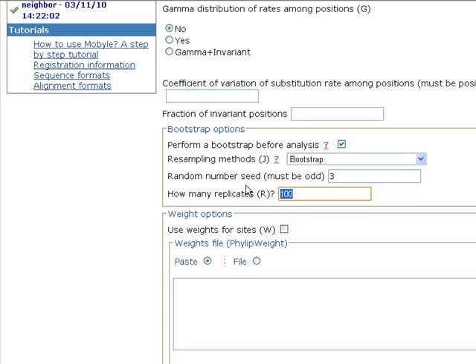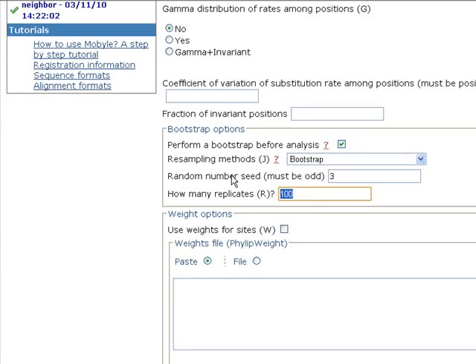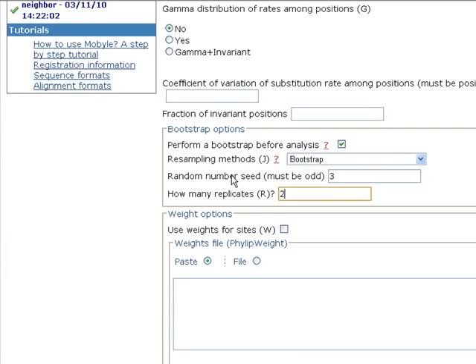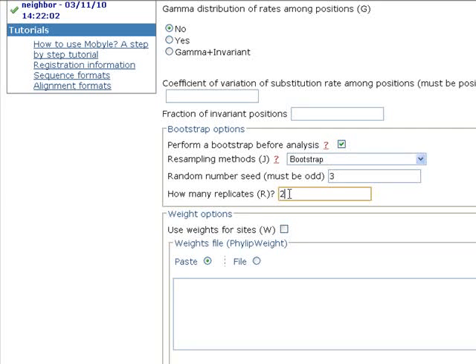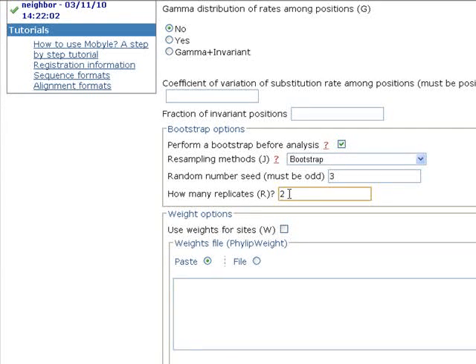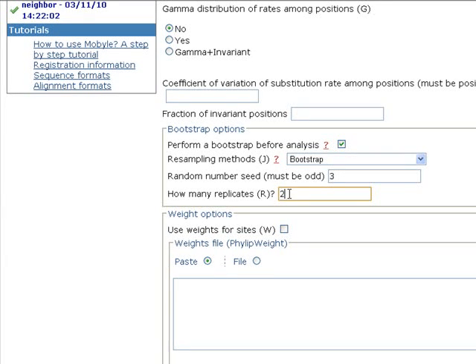So in this tutorial I'll be writing just two because we're just testing this software. But if you have a multiple sequence alignment and you want a robust or accurate phylogenetic tree, you have to write at least 100. Okay.